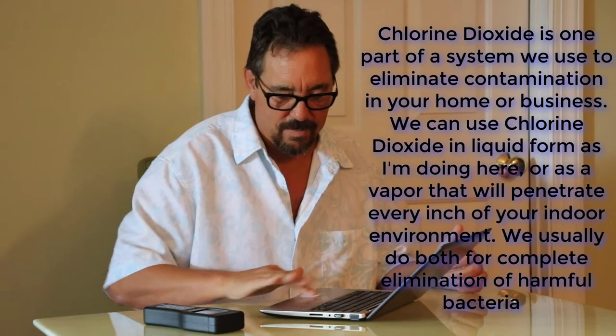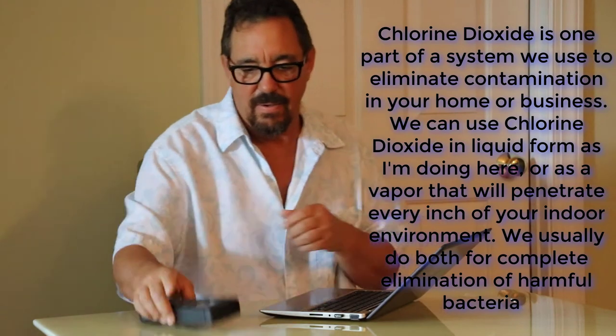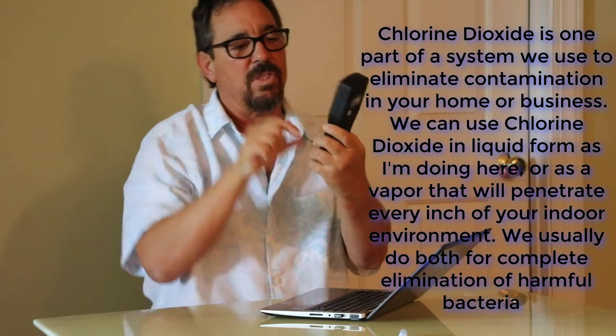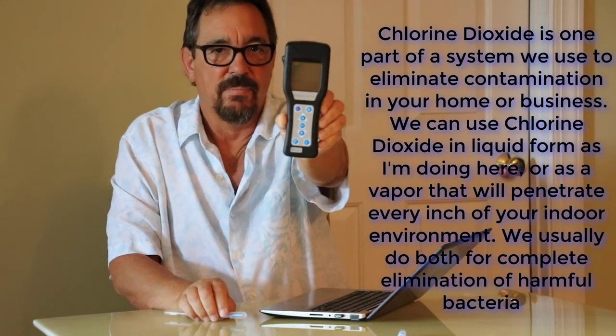A 259 means this laptop is really, really dirty. I'm going to come back in a second, clean this laptop, and then do another test. Here we are — I've got 125 parts per million of chlorine dioxide. We clean it real good, not putting my finger on there to recontaminate it. That should be good. We're going to take out the old swab where we got 259 and get a new swab. We'll start the machine and let it count down from 15.